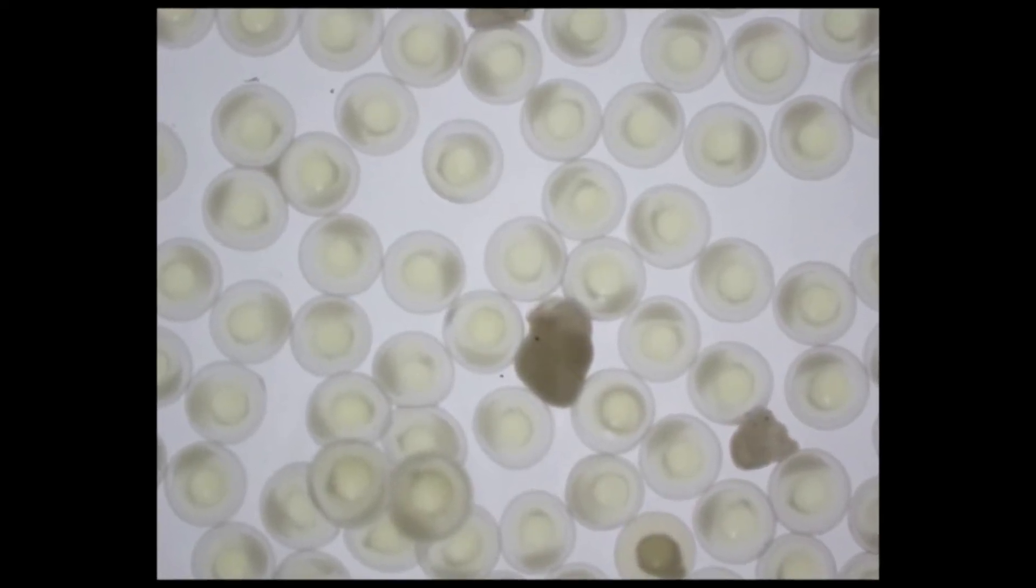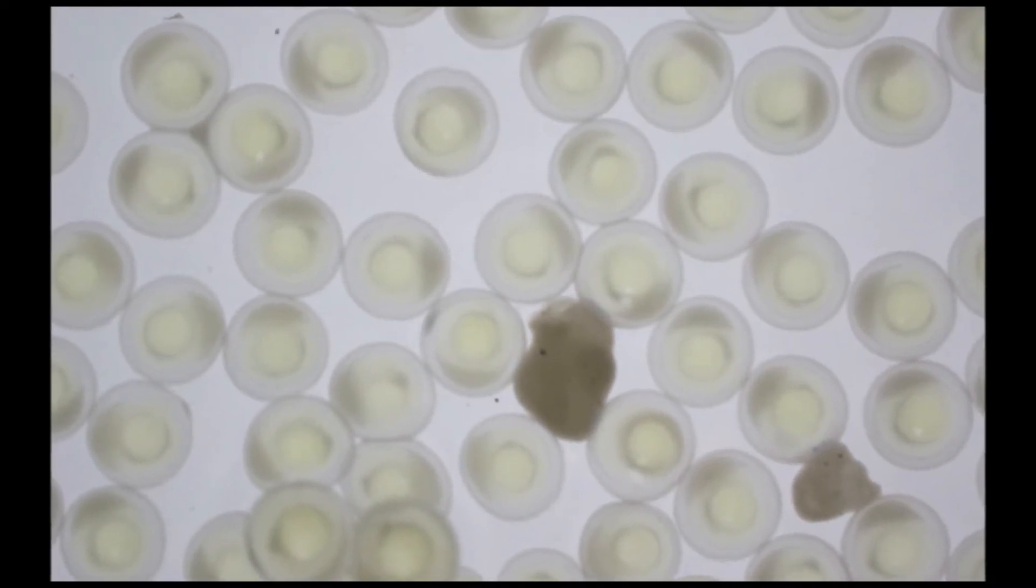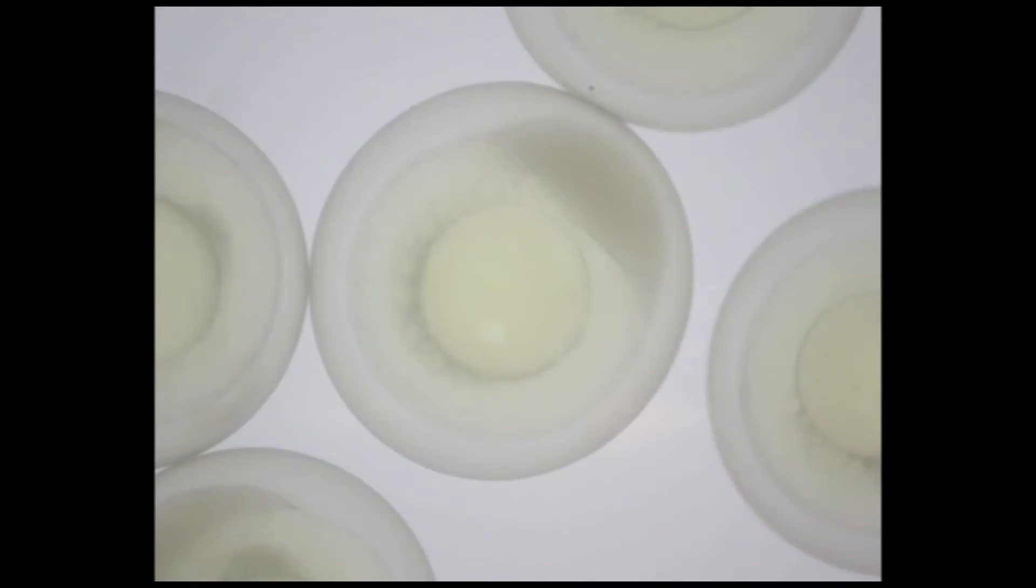Egg fertilization can be observed in as little as a few hours post-fertilization, but becomes very evident after 24 hours utilizing a microscope. In fertilized eggs, cell division begins to occur, creating what looks like a cap at one side of the egg.